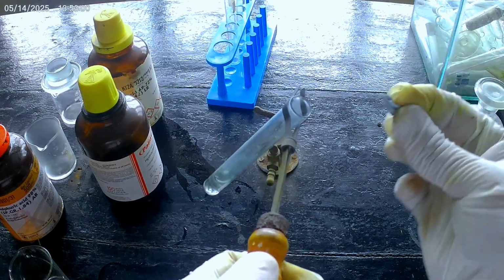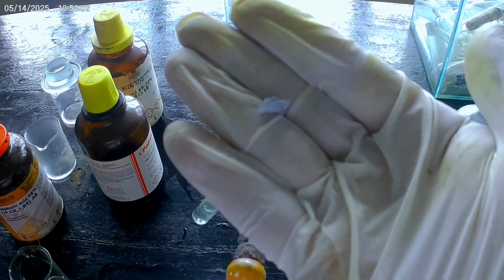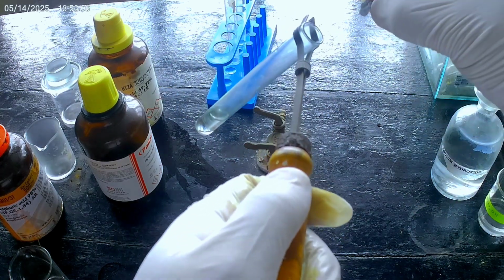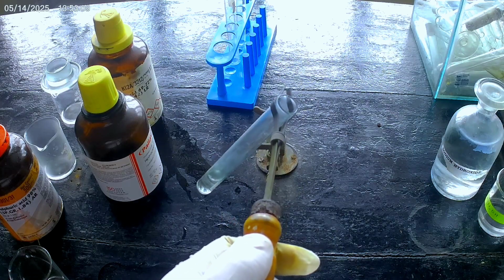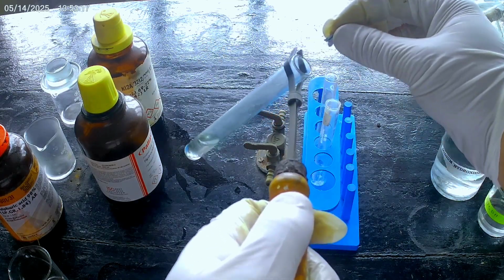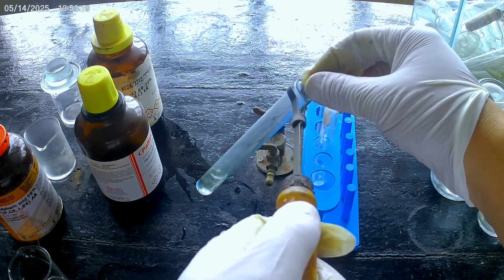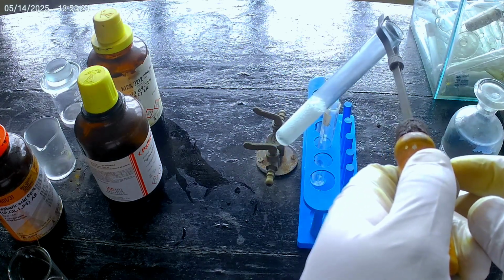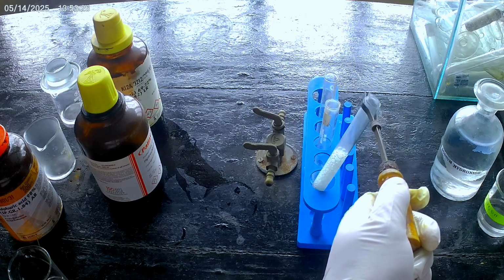Here I'm going to take zinc metal. This is how it looks. Here we go, it's hard. And I'm going to put this inside the acid. Then what do you notice in this acid? So I'm going to put this. You will notice the zinc starts to dissolve in this acid, thereby producing a gas.